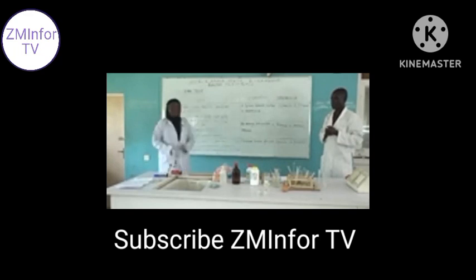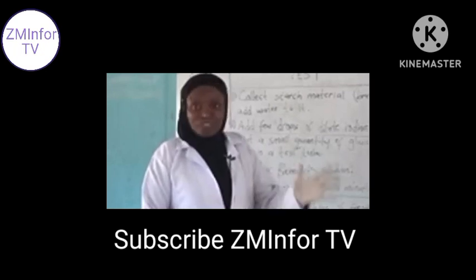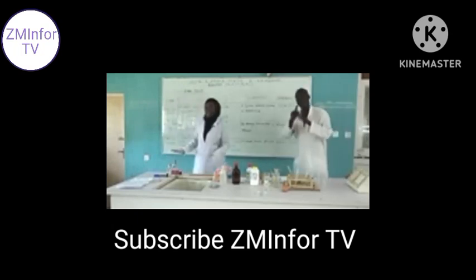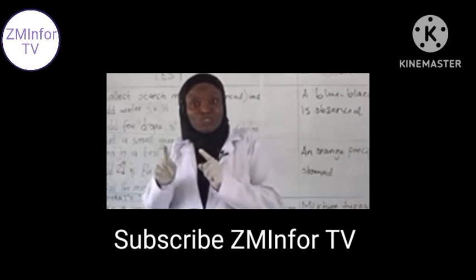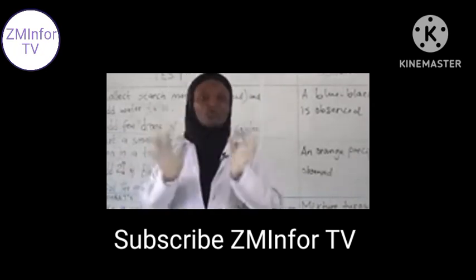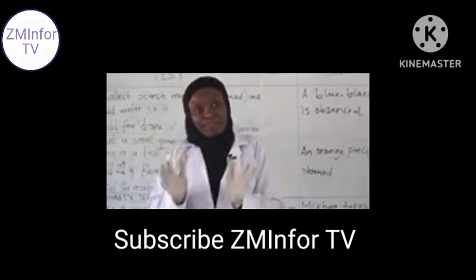So it is very important that we know these things, we carry them out carefully and gradually, and we have our best result, if we keep to the instruction given. The examiner will definitely give you the table. Test for a particular thing gives you the procedure, and now it is left for you to follow the procedure strictly and then observe what will come out of it. Your observation gives you your inference. That's okay for now.